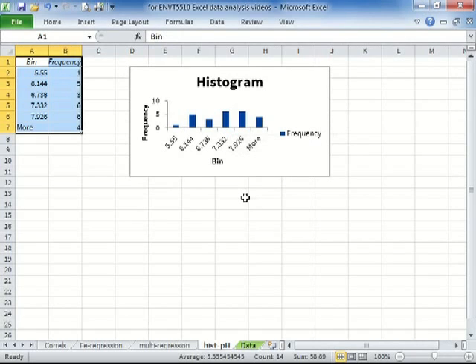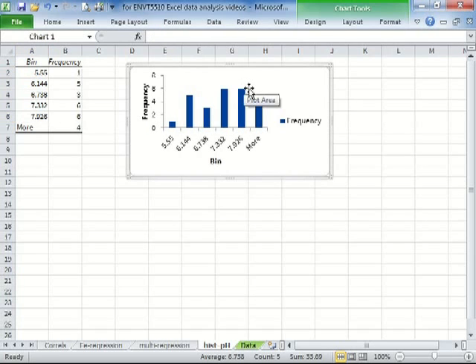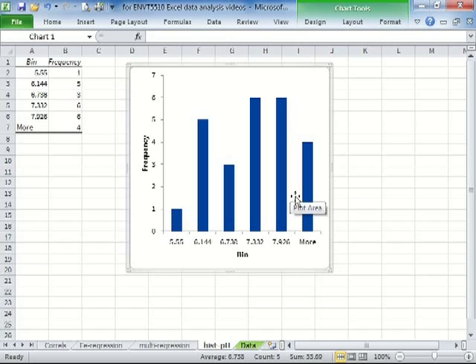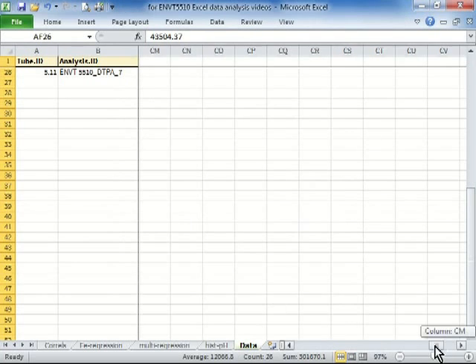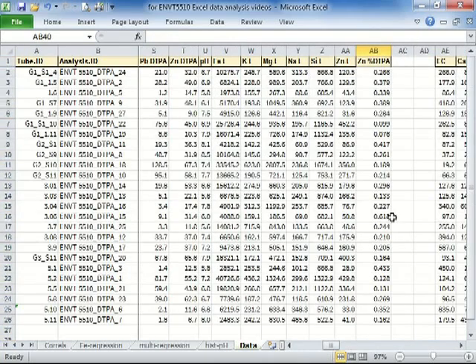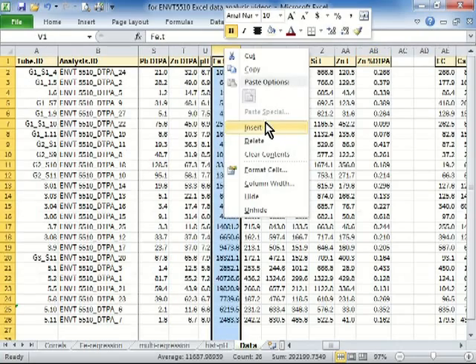So let's do that. Okay, so never mind the odd position of breaks in the histogram, which is just something that Excel does. So if we delete that and that, Excel's usual chart junk, we can see that there does appear to be a bimodal distribution in pH, which might cross over at about, maybe about 7, just for argument's sake. So what we could do then is we could go back to our data and divide it up.